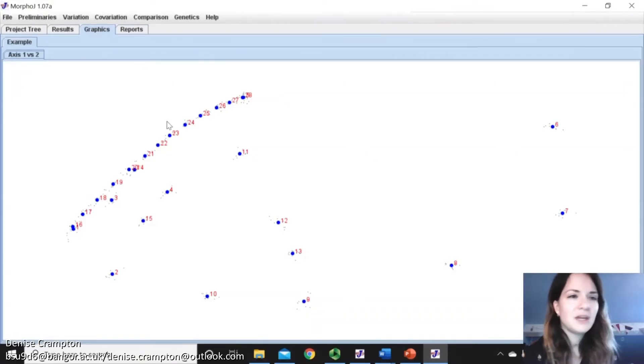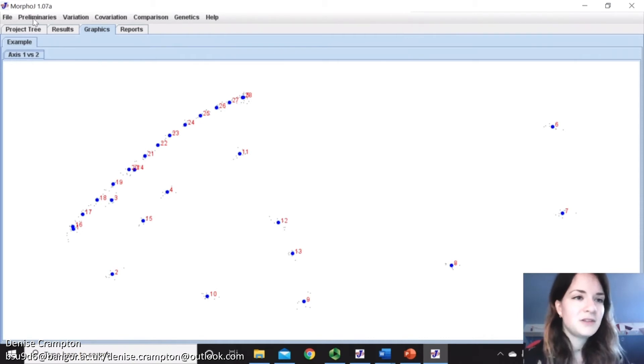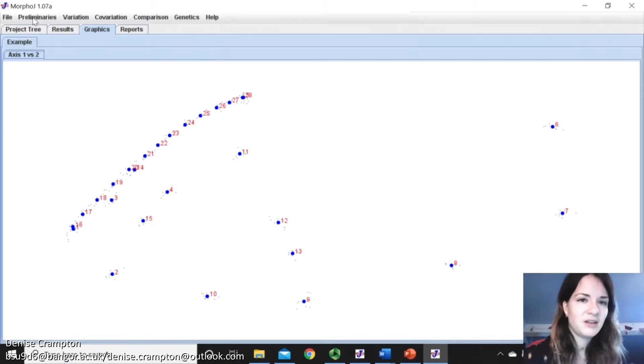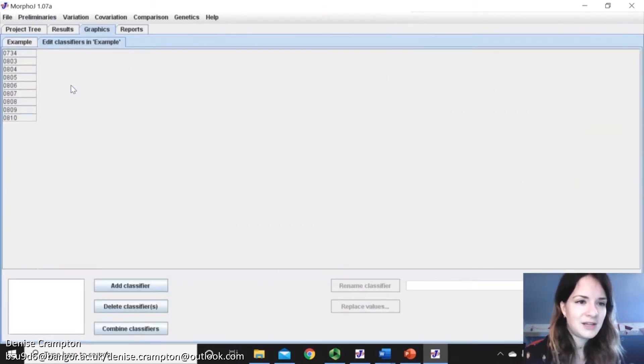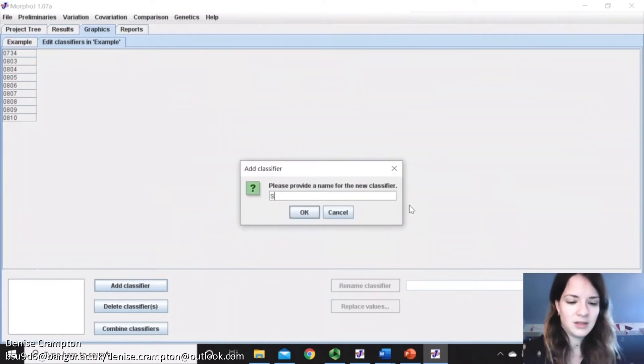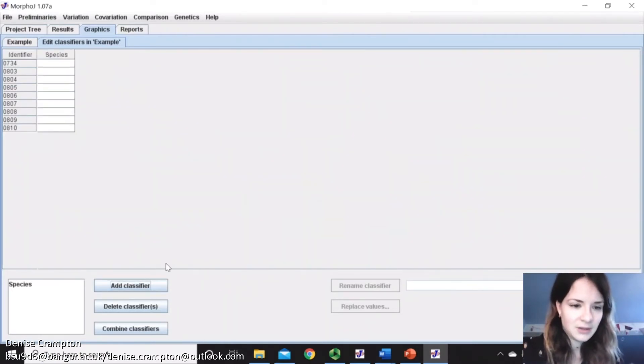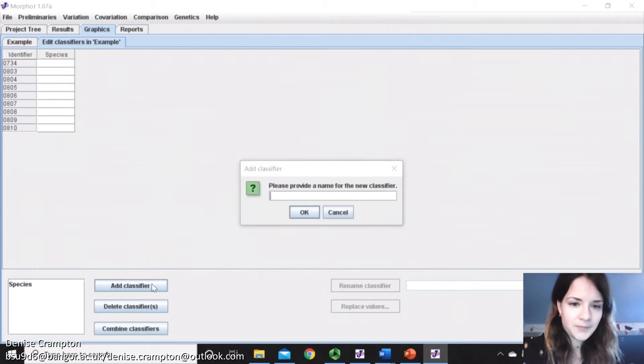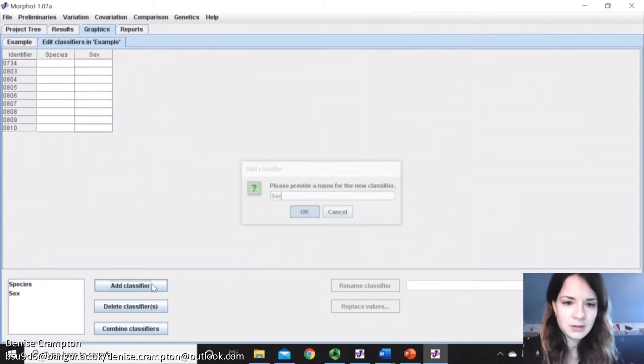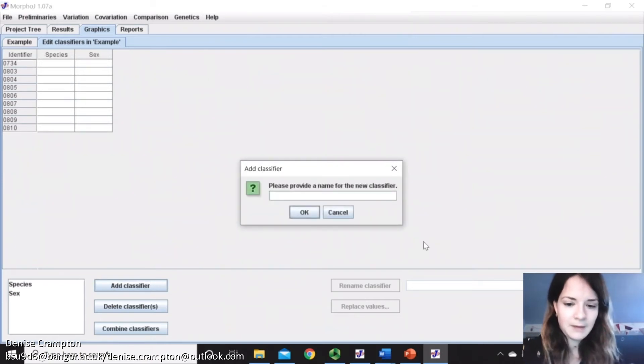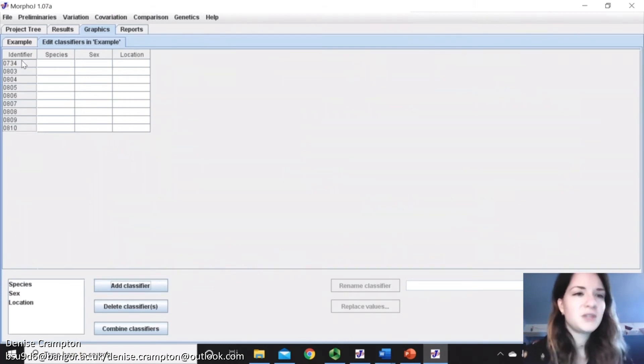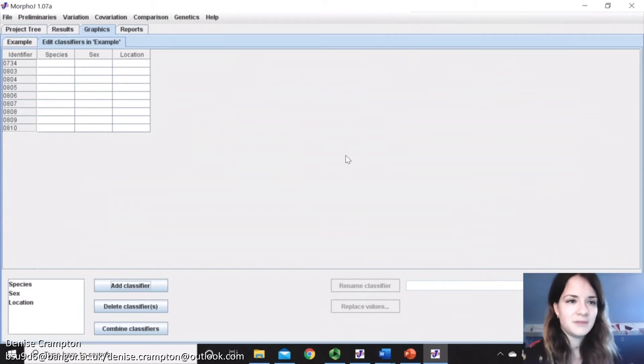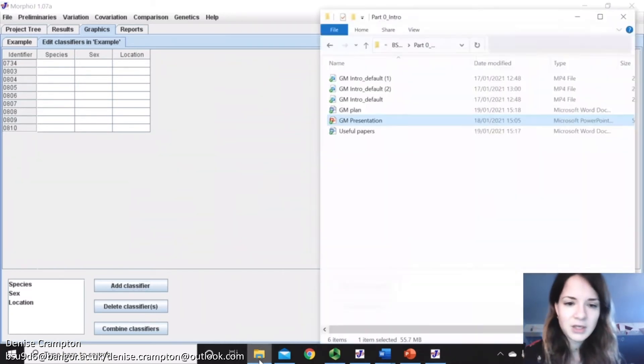So something else that's quite useful to do and will be helpful later is to add classifiers. So if you have quite a small dataset, like anything under like a hundred, you could just edit them and just add them yourself. So add classifier and then say species, sex, things like that. But if you have a large one, then this will be quite tiresome. So the best thing to do is create your own classifier file.